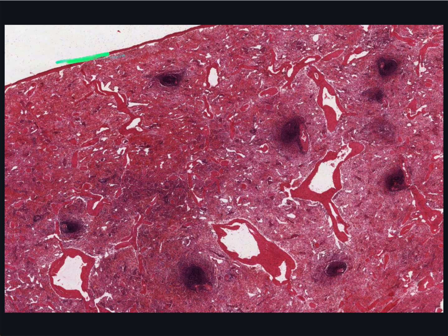White pulp are small islands of dense lymphatic tissue. They're dark purple because the predominant cell types are small lymphocytes with dark nuclei and scant cytoplasm. Characteristically, a small arteriole, the central artery, accompanies every island of white pulp, and in places you can just see a faint pinkish profile of these vessels. Look here, and over here, and again here.